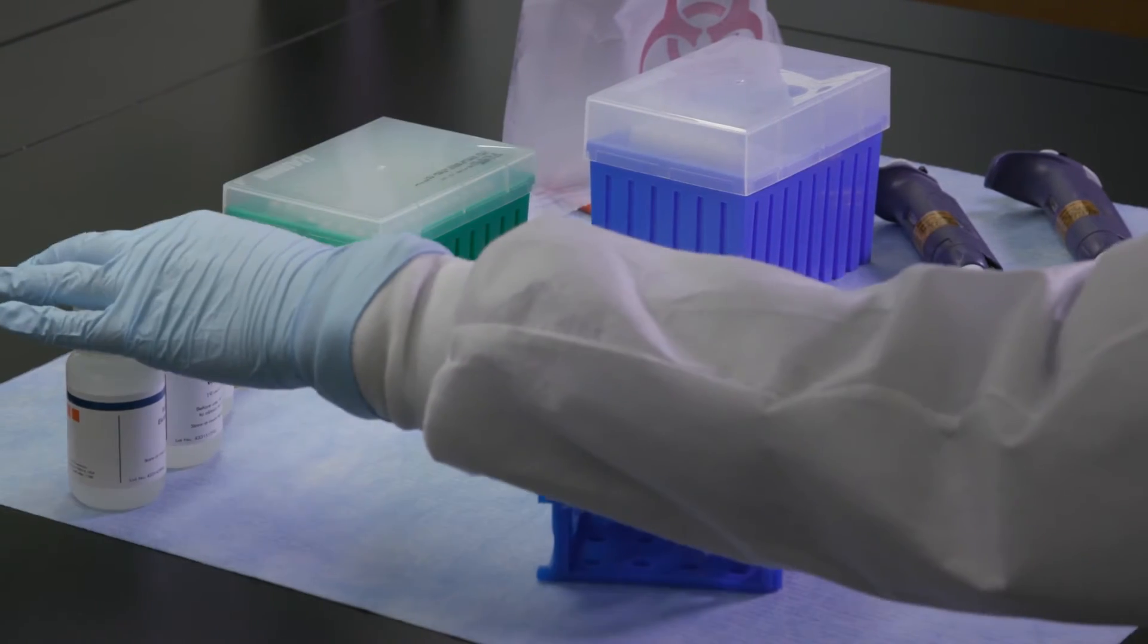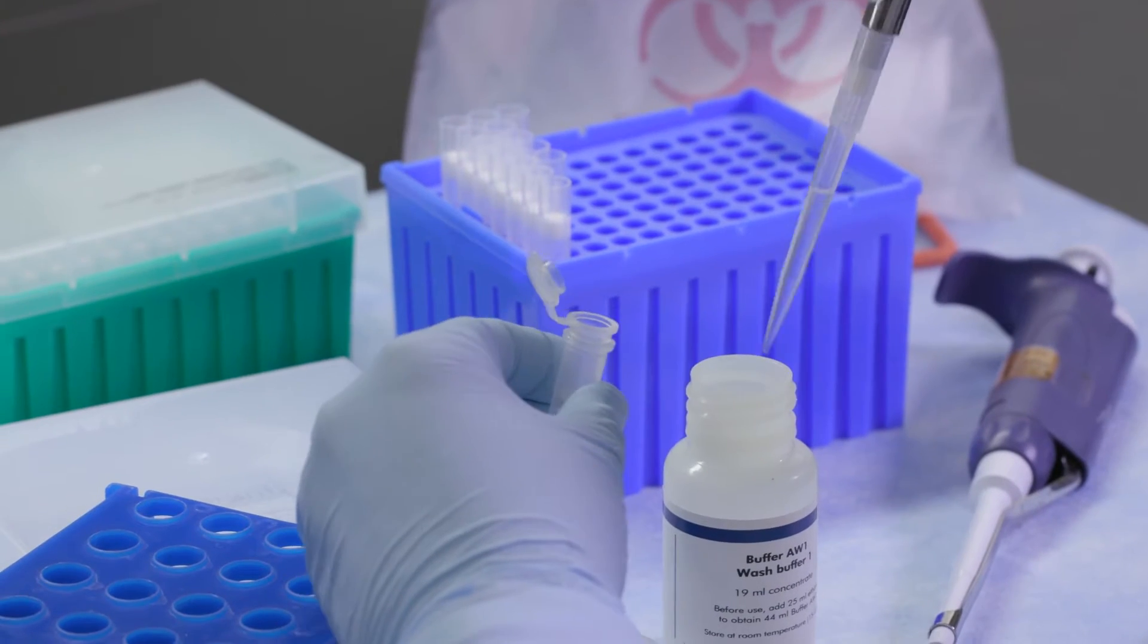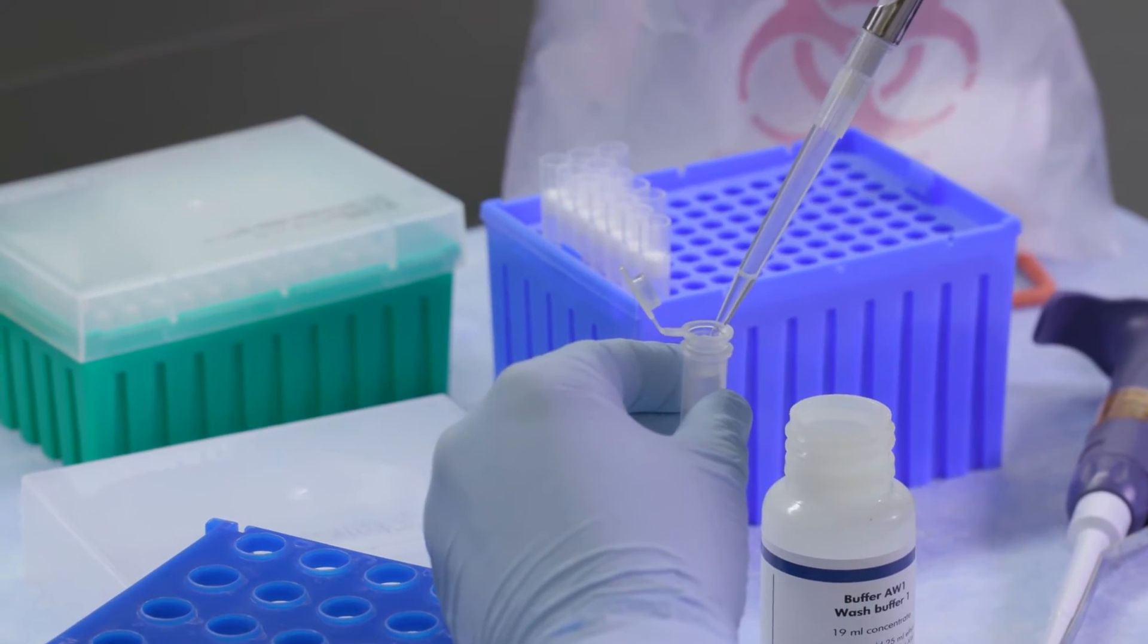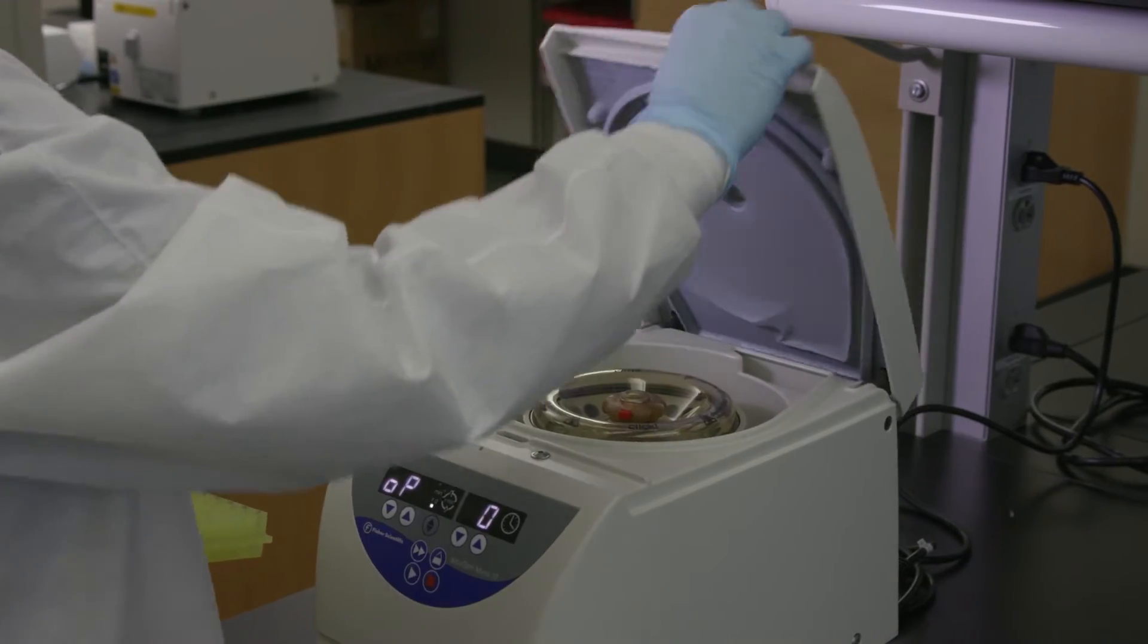After sample application, nucleic acid binding proteins may stay bound to nucleic acid and remain in the column. Pass a buffer containing a low amount of caotropic salt through the column to remove these proteins.